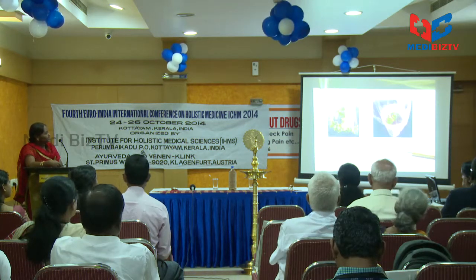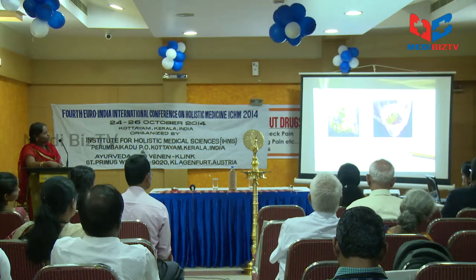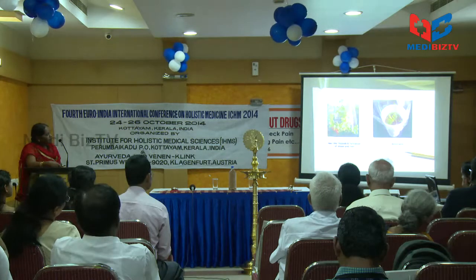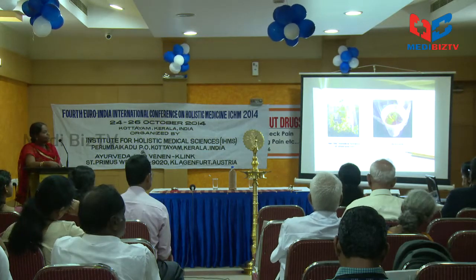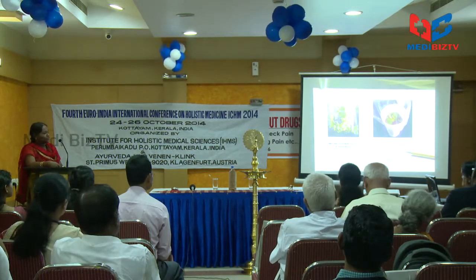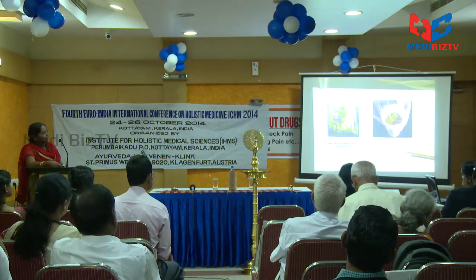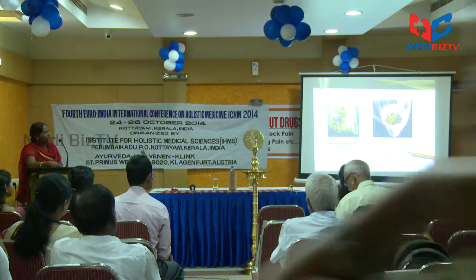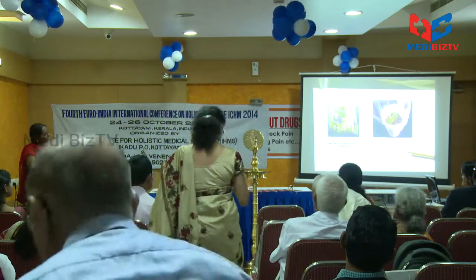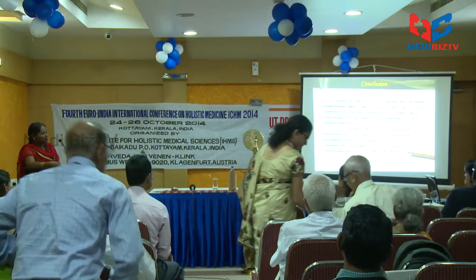Next slide. And this figure shows the small hair-like structures and formation of root and shoot. Here small hair-like rhizoids are seen and activated charcoal is added to remove the phenolic exudates, and GA3 is used for shoot elongation as well as for shoot multiplication. And this is a hardening stage. It is done with the help of vermiculite, and it was maintained in the plastic cups under the culture condition, and after that the plantlets were acclimatized and further process was carried out.